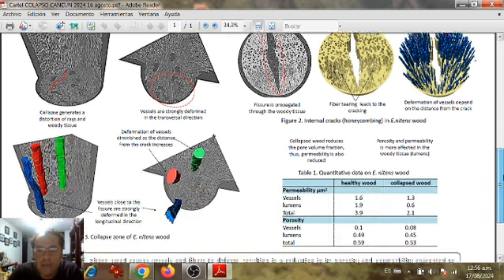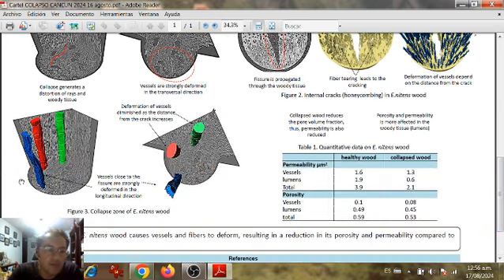This also generates a deformation in the longitudinal direction, which is observed from here and from here, but in this vessel we didn't find it. This indicates that the fluid cannot follow the same trajectory.